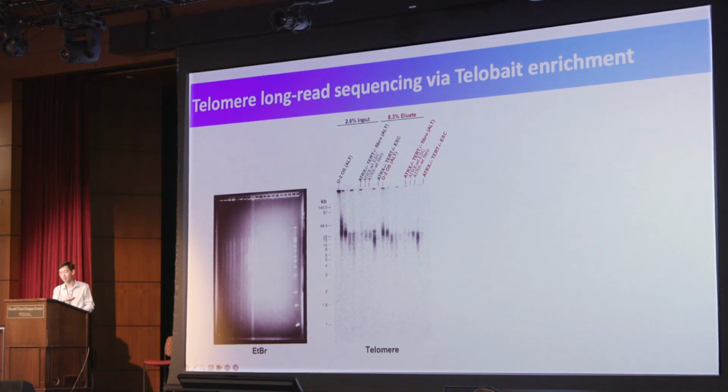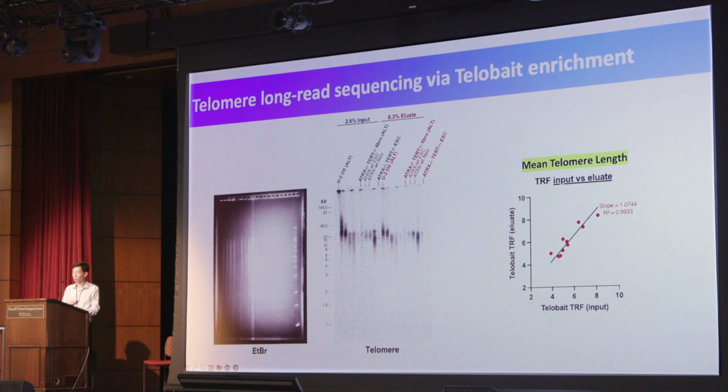as well as the telomerase-positive cells, the ES cells, as well as ATRX knocked-out ES cells that actually remain short, while my ATRX knocked-out fibroblasts gain, I guess, telomere smear, as you can see in the 6th lane. So when I correlate the eluate versus the input, you have a rough correlation of the telomere length, suggesting that this enrichment technique at least works via TRF.